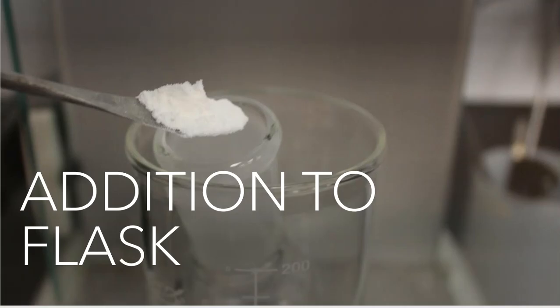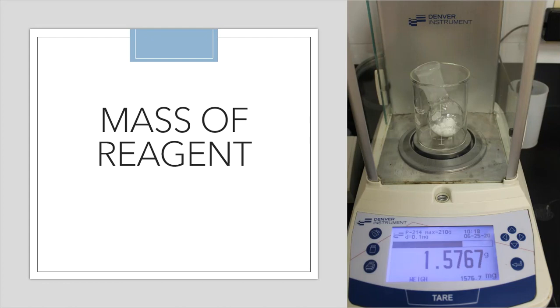So I'm going to take maybe a small scoop, maybe a couple of scoops, and I'm going to slowly add it to this flask. And when I do that, I'm going to keep adding and adding and adding, slower, slower, slower, until I get something that's close to 10 millimoles. And here's where I stopped, 1.5767. So 1.5767 is the amount of trans-cinnamic acid that I have used, or I will use, in this experiment. All right, so trans-cinnamic acid's now done.